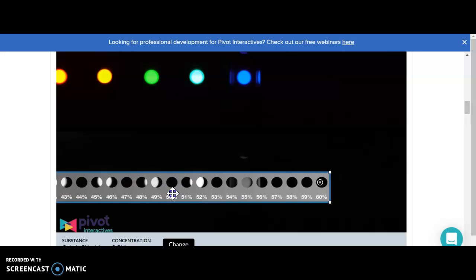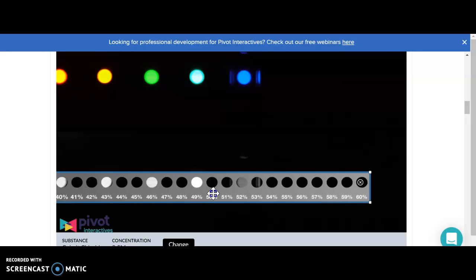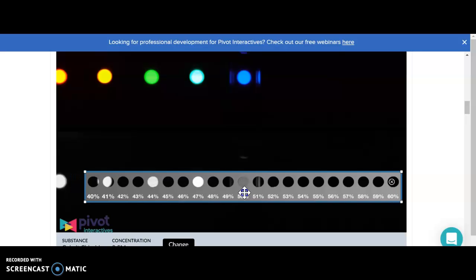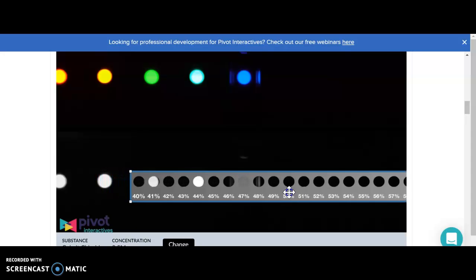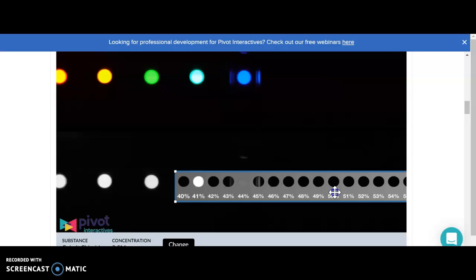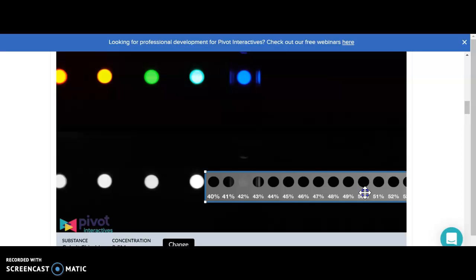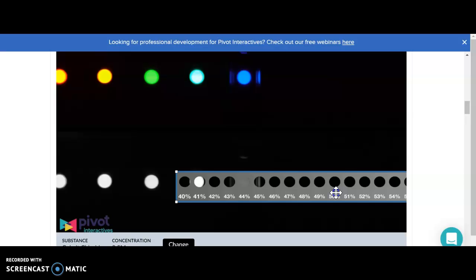You're looking at where you place it over that little circle, and it blends in really well. You notice that you can still see that circle when I put it over these holes because those aren't matching the color. The more I move it over this way, the more it tends to blend in. It tends to blend in best around 44 or 42. Between those two, it's almost a horse apiece where you can barely see it or it blends in really well.